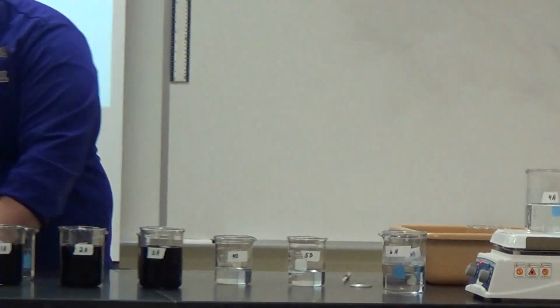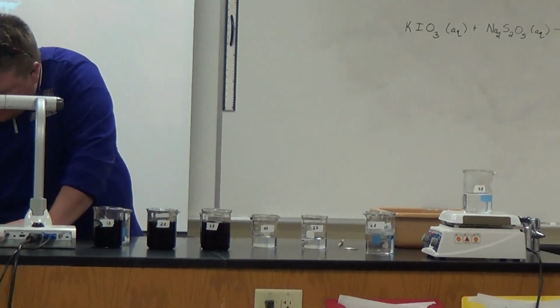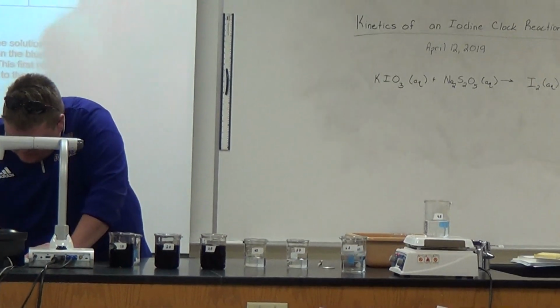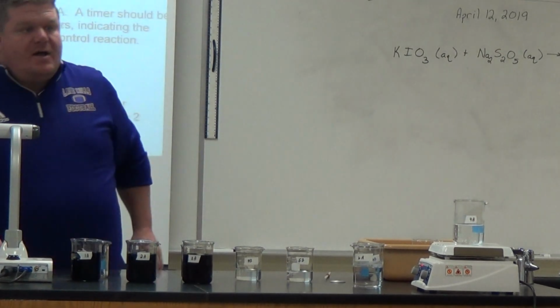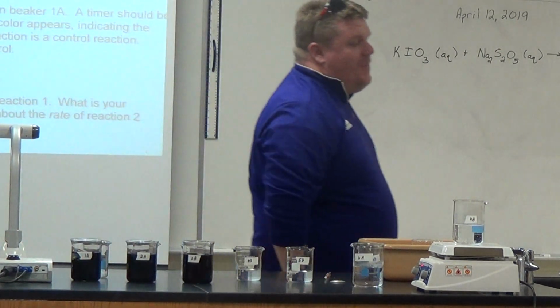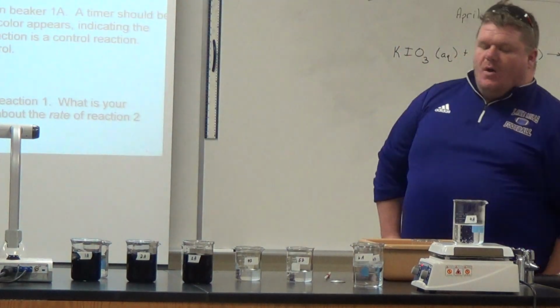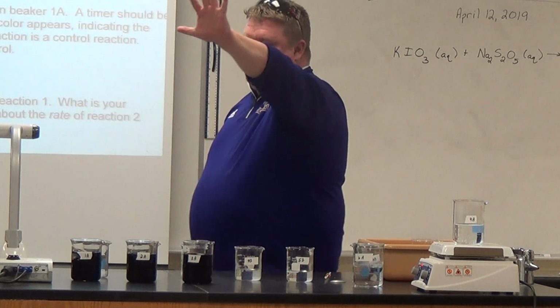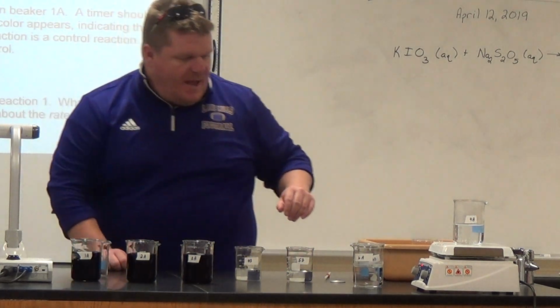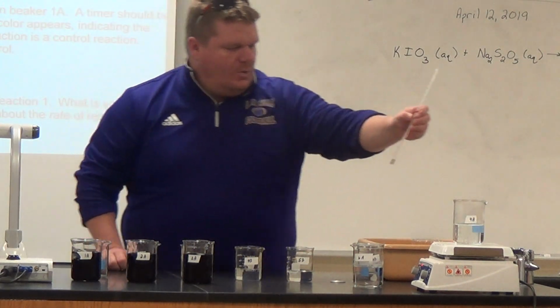All right, so for reaction 5, that is right about 10 degrees Celsius. So find the question there. Oh, that's the wrong one. 10 degrees Celsius temperature up here. Not that. Find the question there. We're talking about the effect of temperature on reaction rate. And for the cold one, this would be reaction 5. Okay, this is number 5, and we're skipping 4 for now. I want to heat that back up just a bit. So it's a little cold for what I wanted.